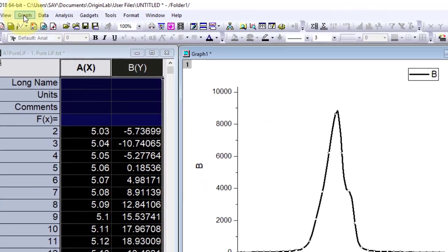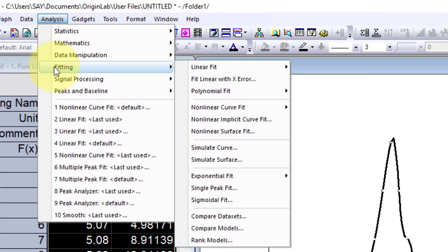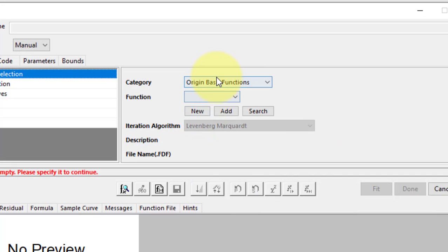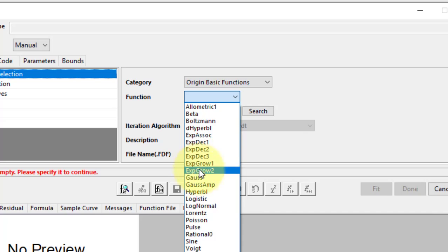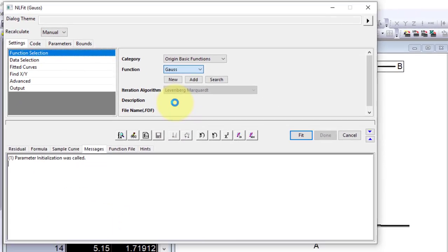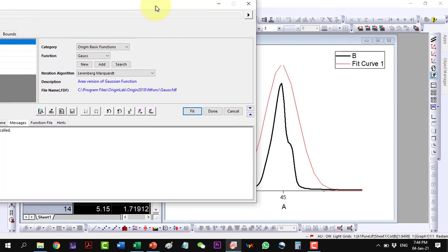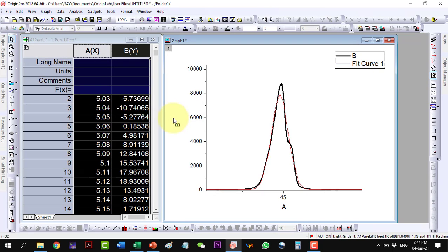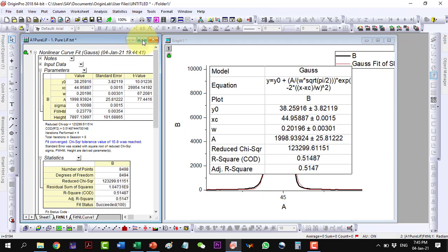Select this peak, go to analysis, then fitting, and go to non-linear fit and open the dialog. We have the origin basic functions, go to the Gaussian function and here it will show a preview. I will fit it and click fit until converge. Here is the fit, so I will click okay and here are the values.